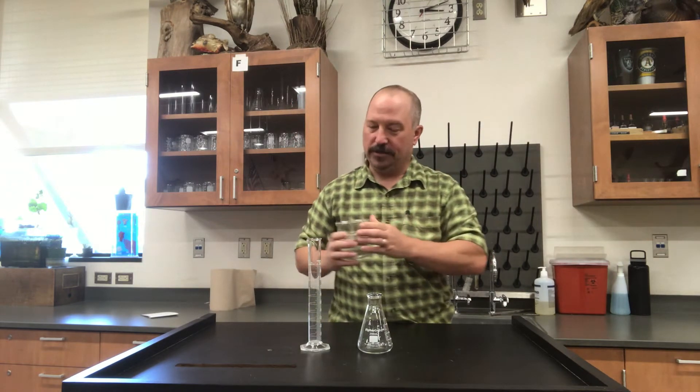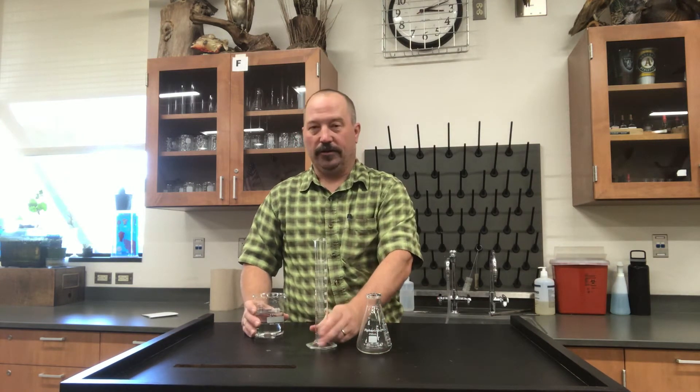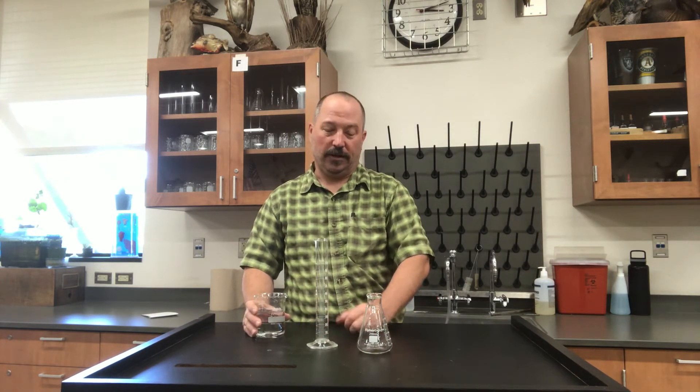For an accurate measure of volume, you would use what's called a graduated cylinder. This is a graduated cylinder — you can tell it's a graduated cylinder because it has degrees.